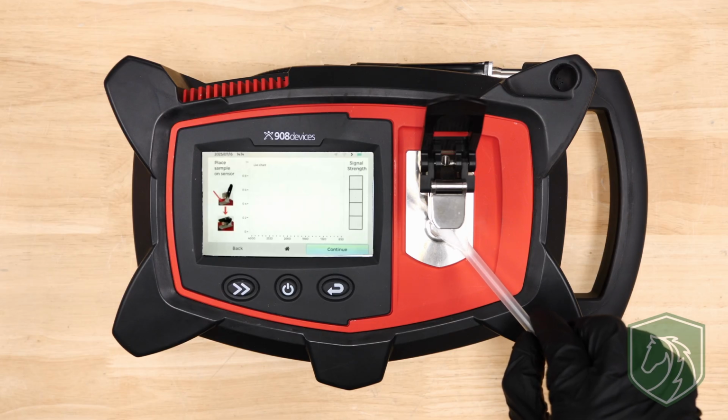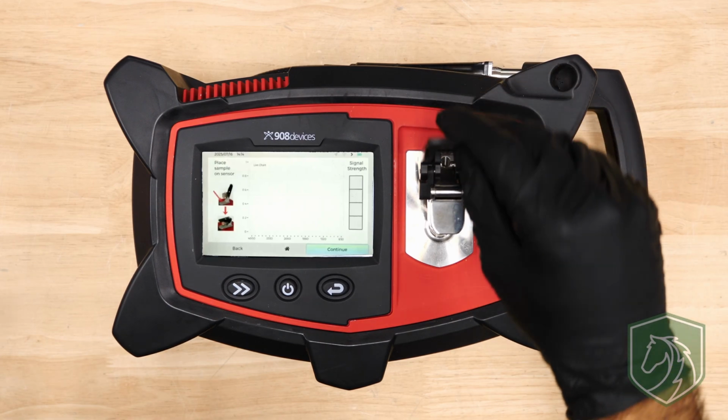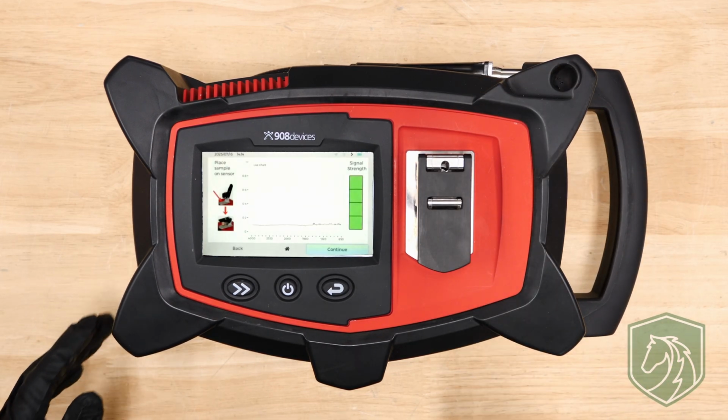Next, place the unknown powder on the sample analysis area and lower the press to ensure good contact of the sample with the sample analysis area. Simply click Continue to begin the analysis.